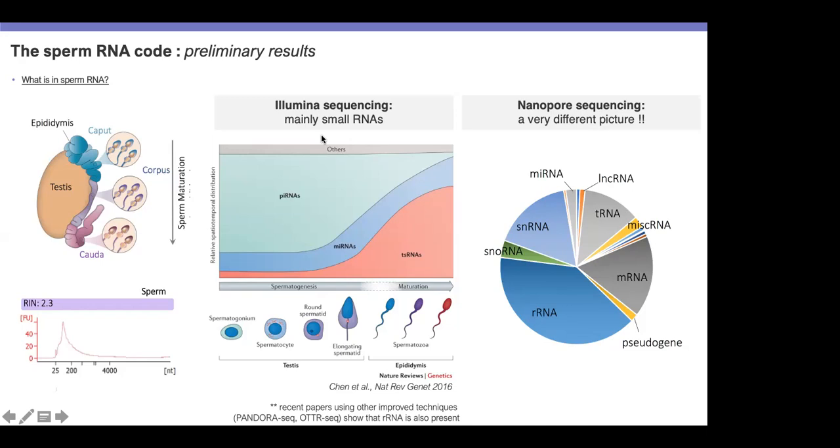Thanks. I have a question. You said that with long reads, you have been able to link some modifications to particular isoforms of a gene. Have you found some example of interesting stuff that only occurs to one isoform? So we do see some examples of that. Right now we're doing the analysis of the data, right? So we already know that there are isoform specific modification examples.